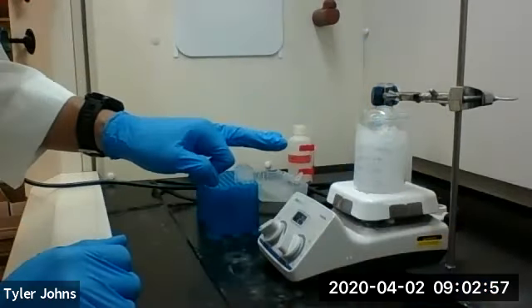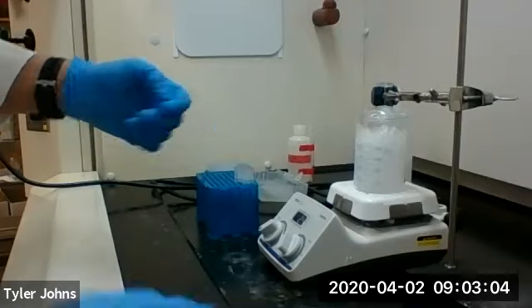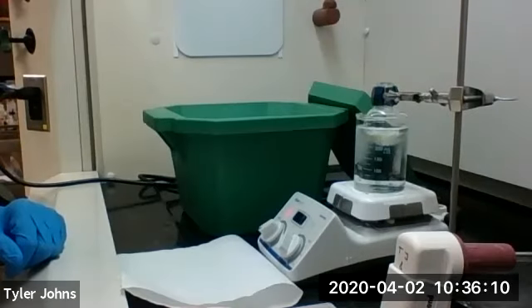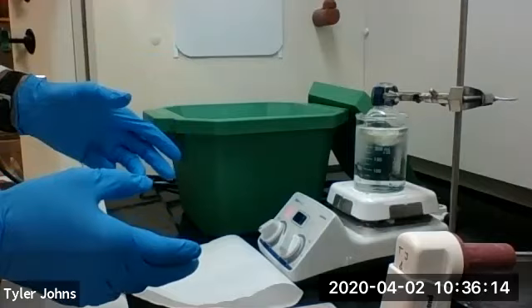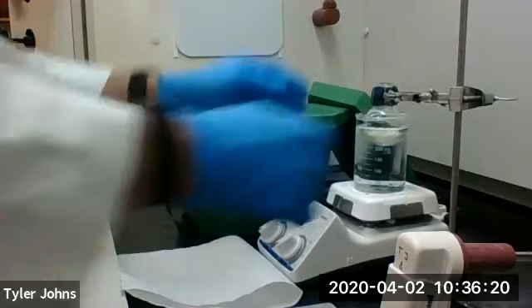We're going to let this stir for an hour. Letting it stir for an hour in an ice bath should give us a reasonable yield of epoxide. So we've had our reaction mixture mixing for about an hour now on ice, so we're going to take it off the ice.